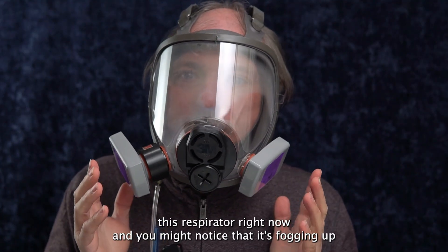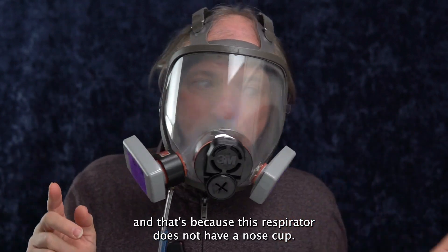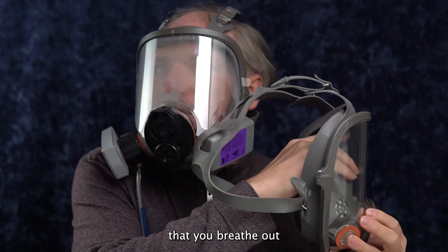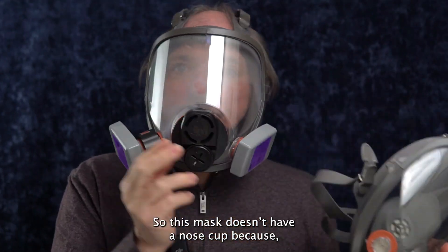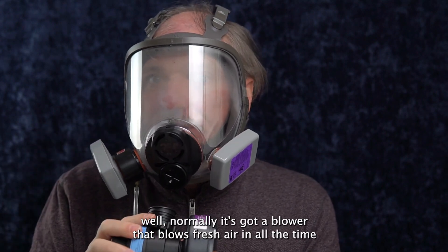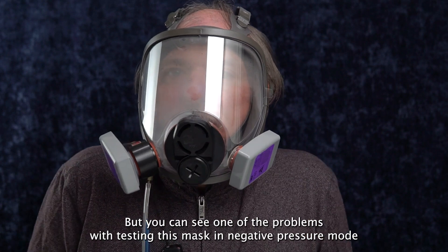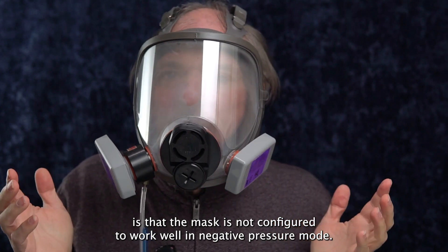I'm wearing this respirator right now, and you might notice that it's fogging up, and that's because this respirator does not have a nose cup. The nose cup keeps the air that you breathe out away from the lens compartment — it only goes out the exhalation part. This mask doesn't have a nose cup because normally it's got a blower that blows fresh air in all the time, and your humid air gets washed out really fast, so it doesn't need the nose cup. But you can see one of the problems with testing this mask in negative pressure mode is that the mask is not configured to work well in negative pressure mode.